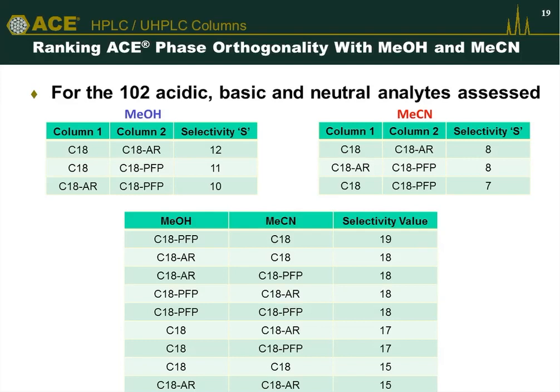Well, I get asked many times, how do I do method development? And I've been to different places where some people use just one column, typically a C18, and they will do all their method development on a C18. And I've been to many companies where they have a dedicated platform with 6 columns or 8 columns, many different mobile phase conditions, and the instrument is running 24/7 for days at a time, generating a lot of data.